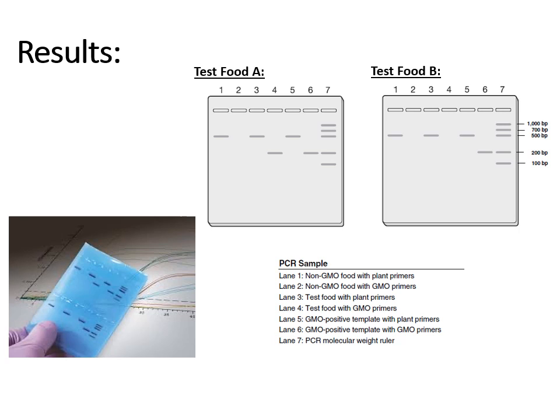If you have any trouble analyzing these, again, rely on lane 7, which you already know every gel must have: a ladder, standard, sometimes they call it a ruler. That is your DNA ladder, lane 7 on both of these. If you have any trouble when you're trying to analyze these, just send me a message in the Remind app, and I'm always happy to help.